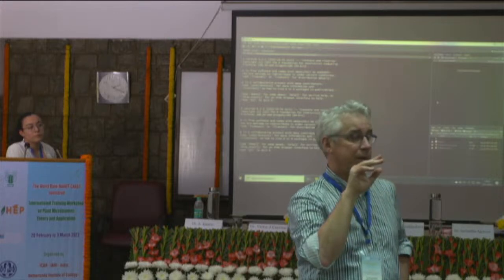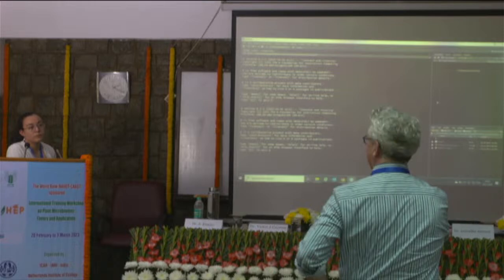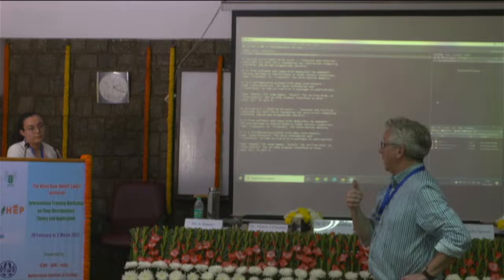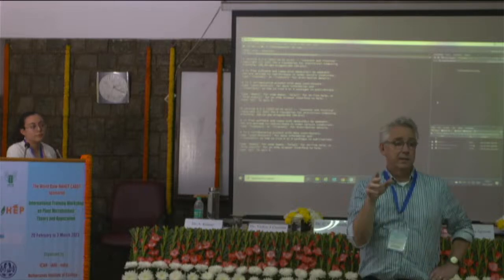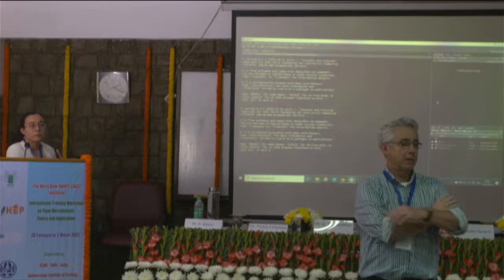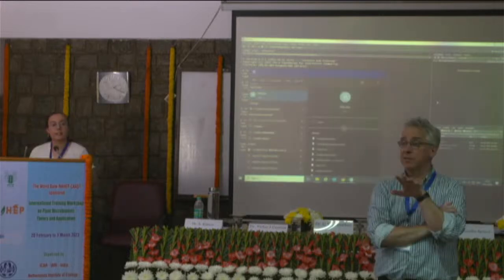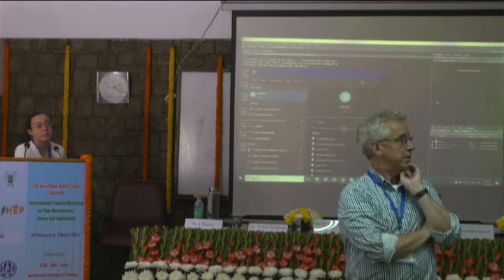So the first step, Luisa, is that they need to have installed RStudio and R. Okay? So, that's everyone installed. Exactly. RStudio. So you type RStudio in your Windows bar, the program here, and then you click it open. You should get the app already when you type RStudio. Is there anyone having an issue with that?